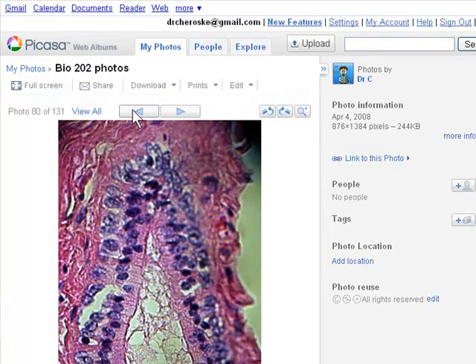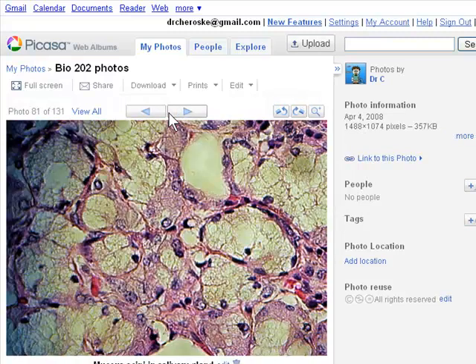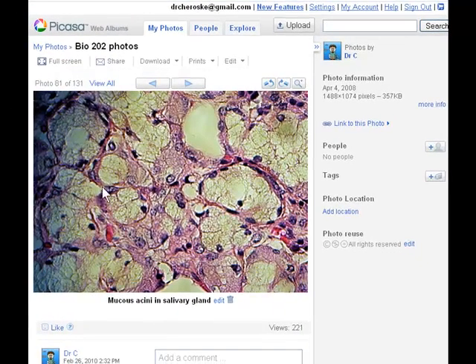Okay, so the first slide that you have is the salivary gland slide. And this one, there's two aspects about it. Very simply, two things they need to know. They need to know the Acini cells, and then they need to know the excretory duct. So when you look at the slide, it's going to be mostly like this. You're going to see these bubbles of material and these mucus secreting glands organized in these round Acini cells with the nuclei that you see out to the side there. So these round bubble-like structures are the Acini cells that secrete the saliva.